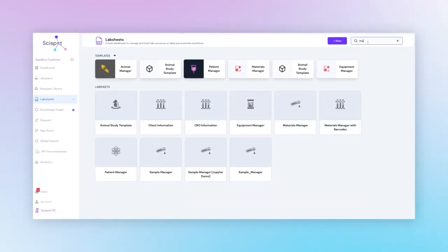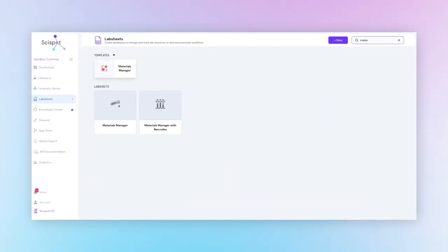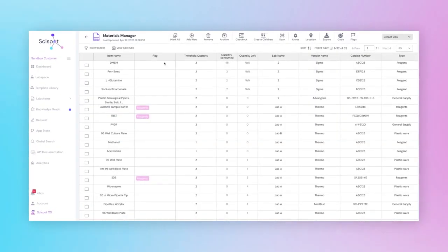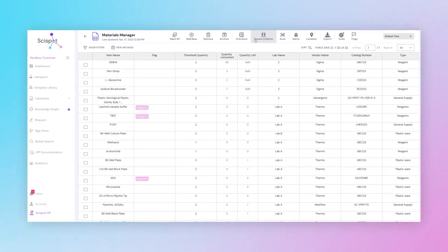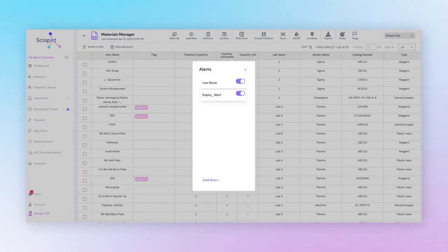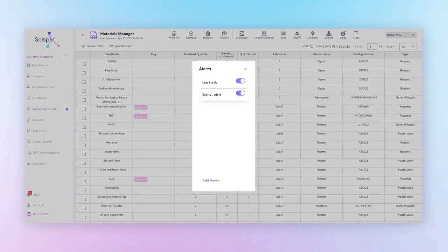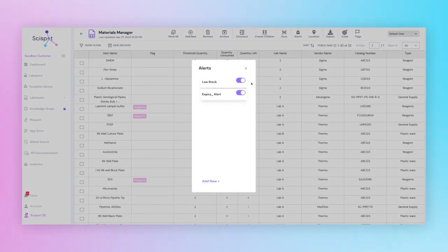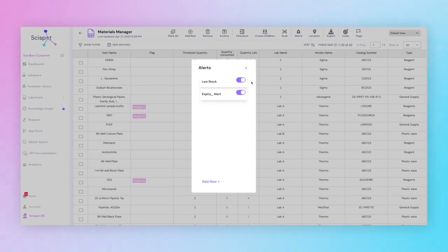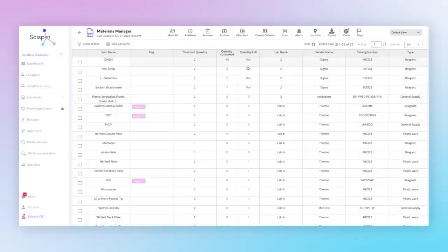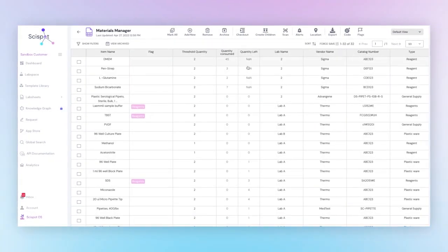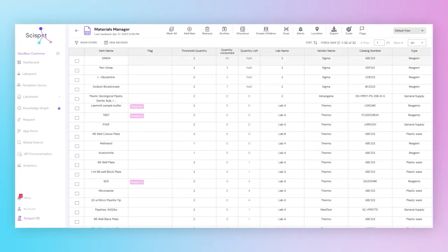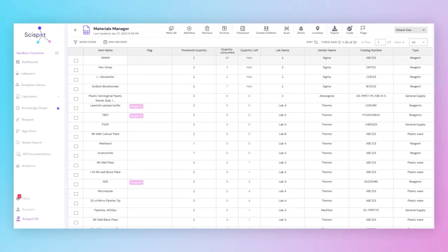And with Materials Manager, you can create flags and different alerts, such as for low stock or expiration dates. Plus, you can automate your inventory by integrating third-party apps like Quartzi.